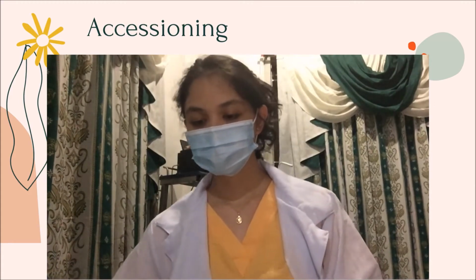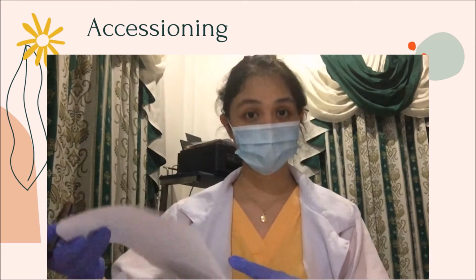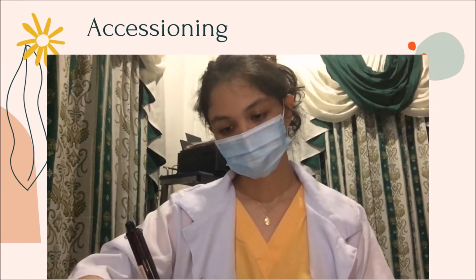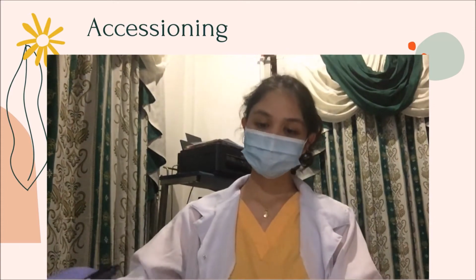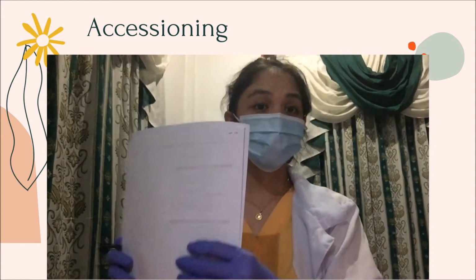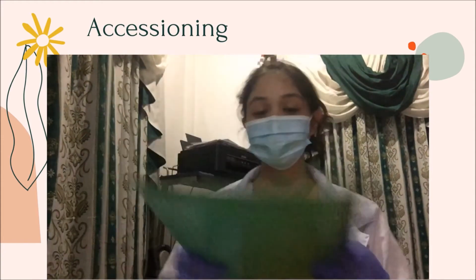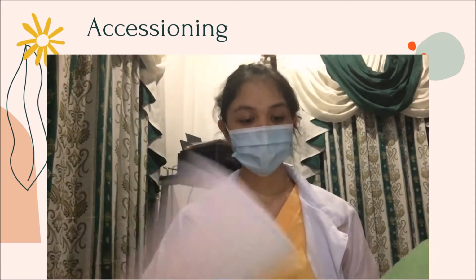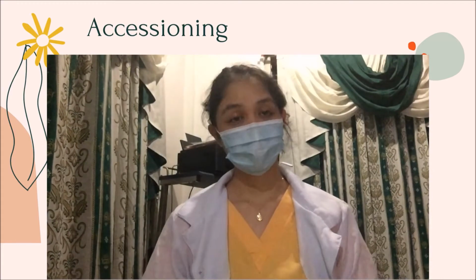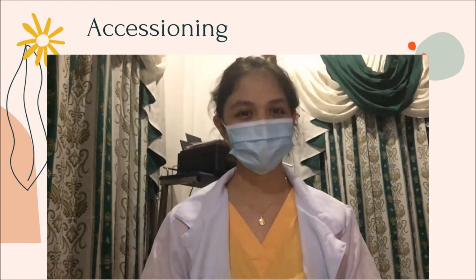So after writing it down, it is now time for us to fill up the surgical pathology worksheet. Okay, so after writing it all down, let us make sure that all the relevant documents are intact and filed in one folder. Okay, and then after that, it is now time for us to proceed with fixation.